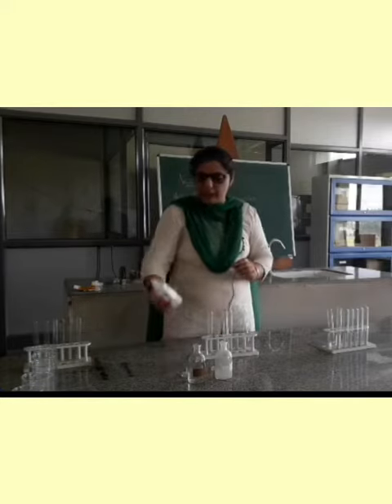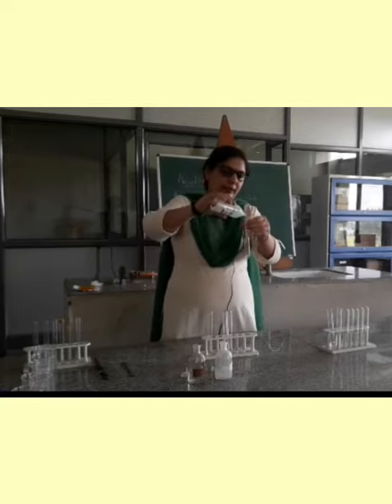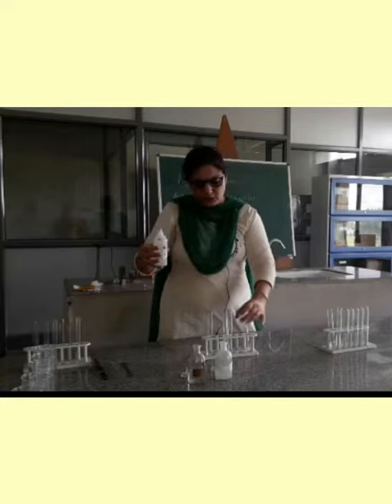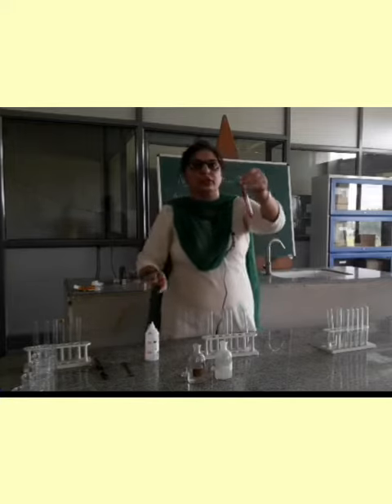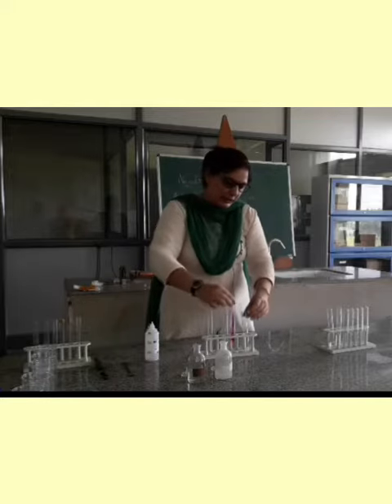Now, phenolphthalein indicator — how does it respond to these? First, I am adding it in. You will notice that there is no change. A little turbidity is only there. And when I am adding it in a base, it is showing a color change. It has turned to magenta.